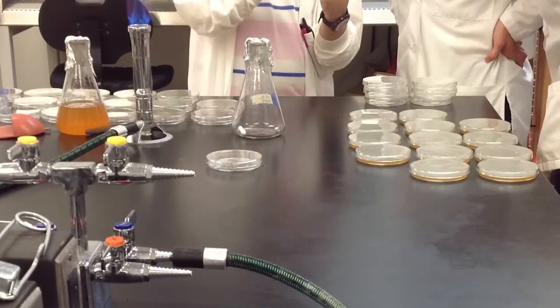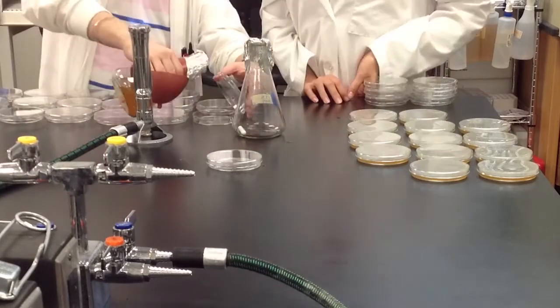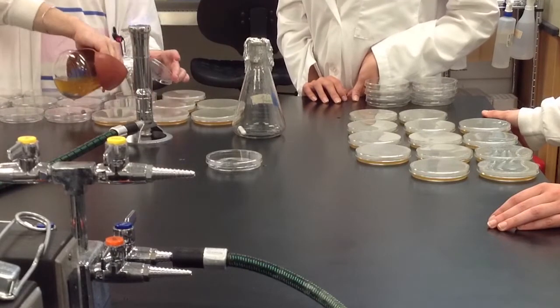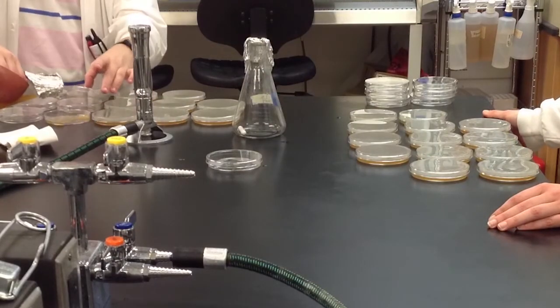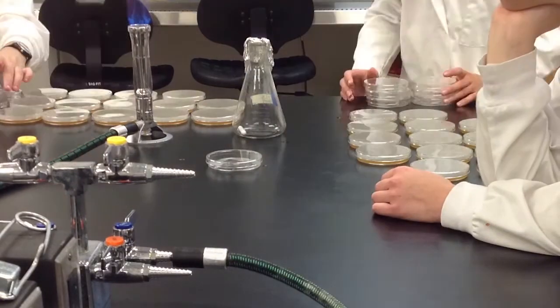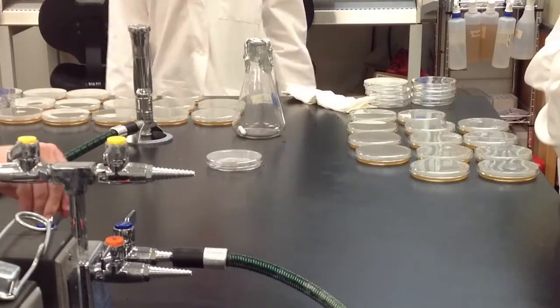After they were hard, we went ahead and flipped over our Petri dishes and we labeled them according to the percent and according to the material being used, as in 5% nutrient agar honey concentrate or 15% agave nutrient agar concentrate. We went further and we drew quadrants onto our Petri dishes and labeled each quadrant according to the bacteria strain that we would be inoculating in the agar.